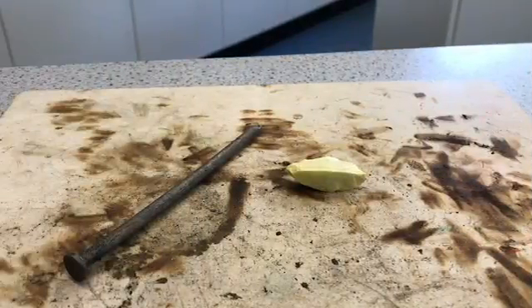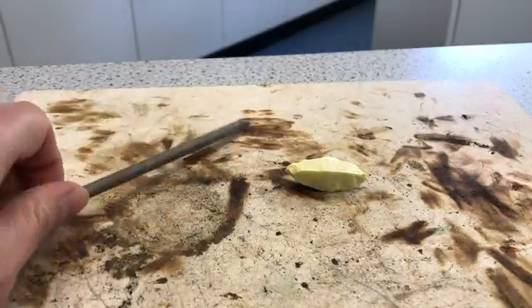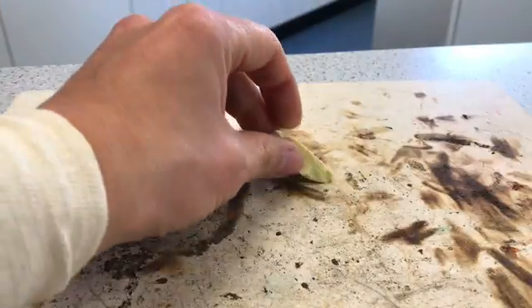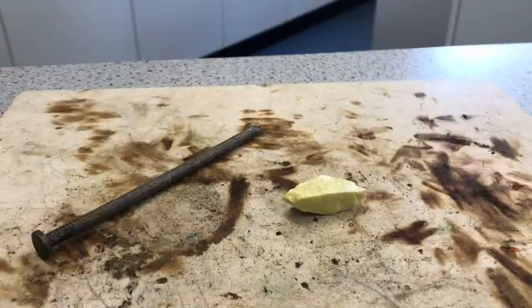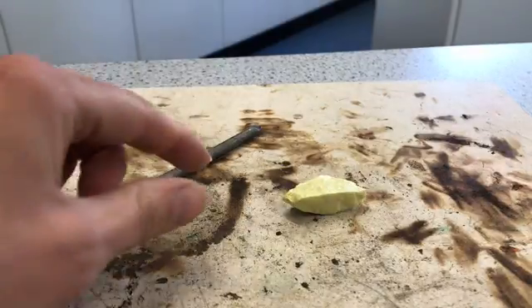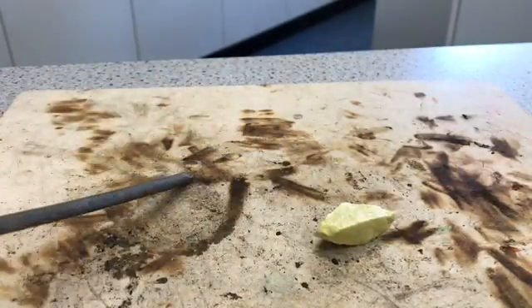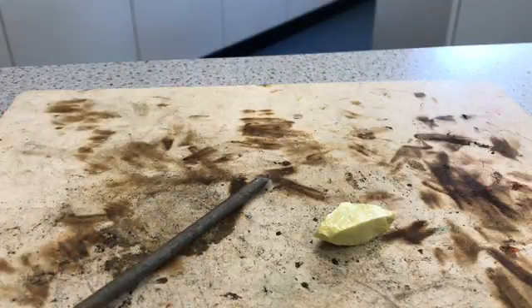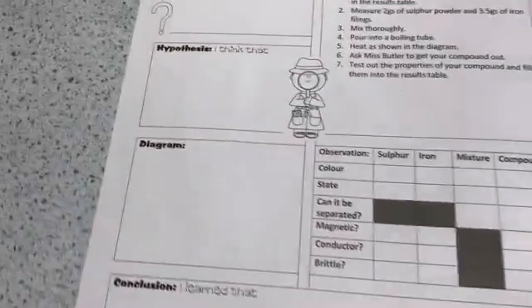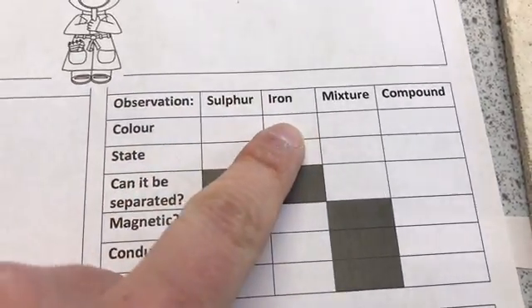We're going to compare the properties of our original elements — a lump of iron and a lump of sulphur — with the properties of the compound that we make. The first property we're going to observe is the colour. Sulphur is a very nice yellow colour and iron is a silvery grey colour, and we're going to fill those in on the table on our worksheet.